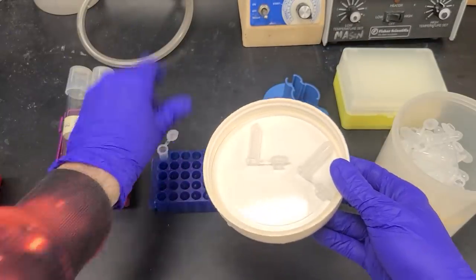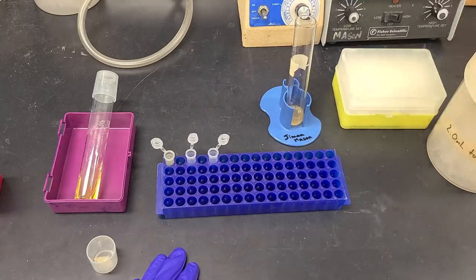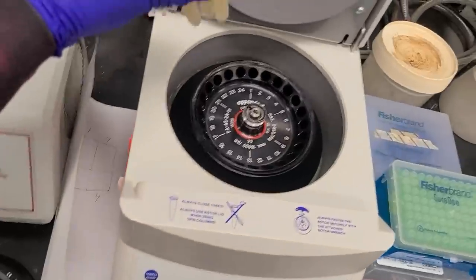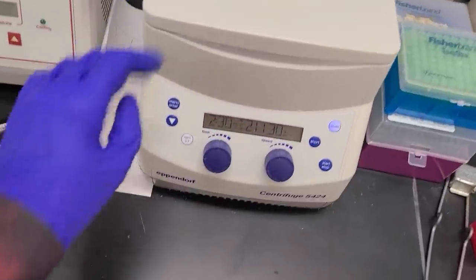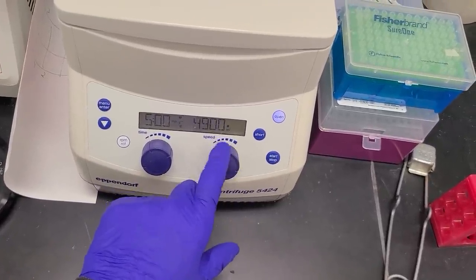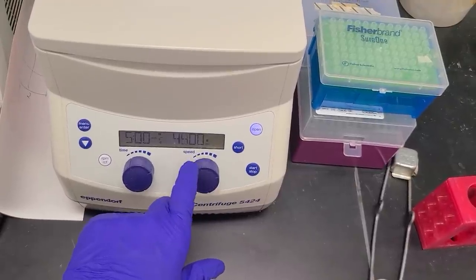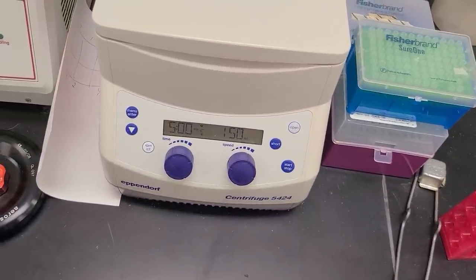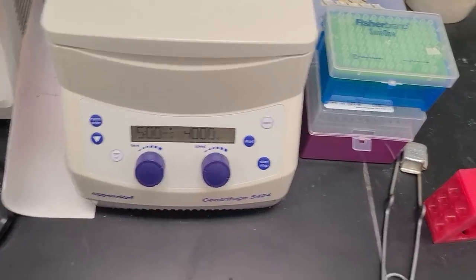All right, next we're going to get some of these tubes out and put the bacteria in those tubes. We're going to put these in the centrifuge that spins them really fast. This thing is going to spin them around super fast, so we're going to come back in 5 minutes. This is spinning them at 4,000 times the force of gravity, relative centrifugal force. Start. Let's go. All right, be back in 5 minutes.